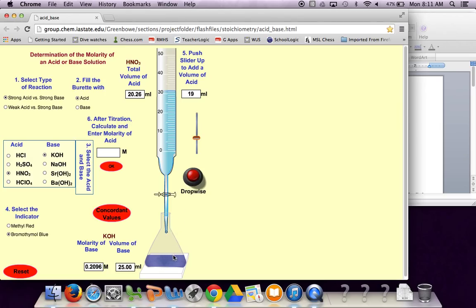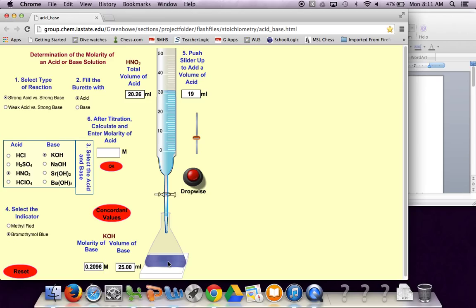Also what you'll notice when you're doing the lab is that you'll see that the liquid, as the acid hits the base, it'll turn maybe green for a second and then sort of disappear into blue. The longer that green kind of persists actually tells you that you're closer to the endpoint. But on the computer you're not going to have that advantage. There we go.